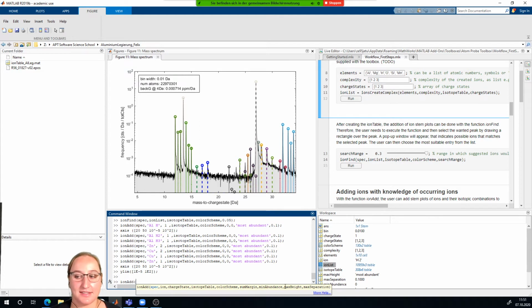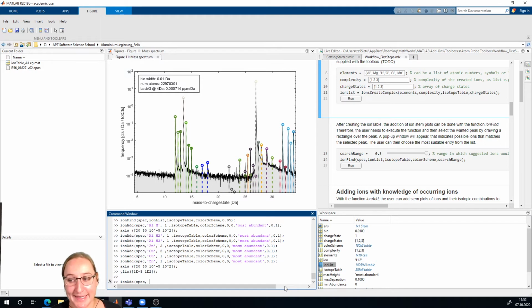Most of the time it appears, sometimes it does not. But when I start writing, it goes away, and that's a real problem. I don't know what I can do so that it will stay, so I can continue writing and know what variable I'm typing in.